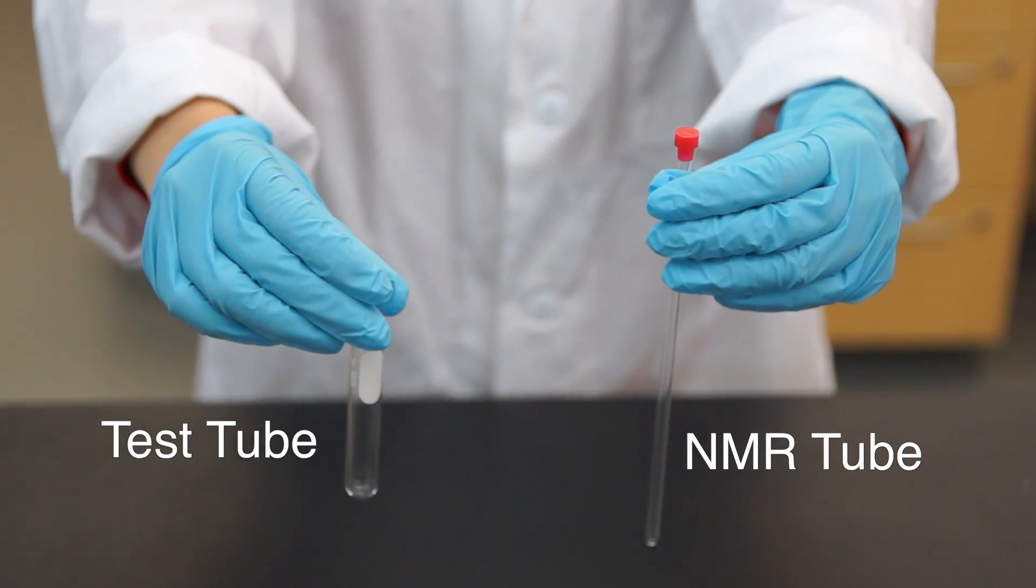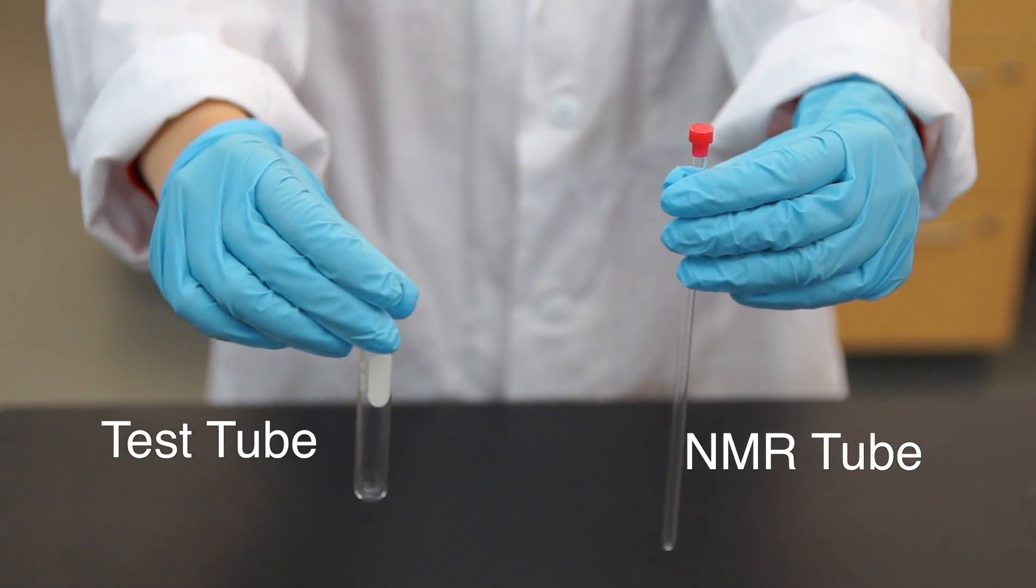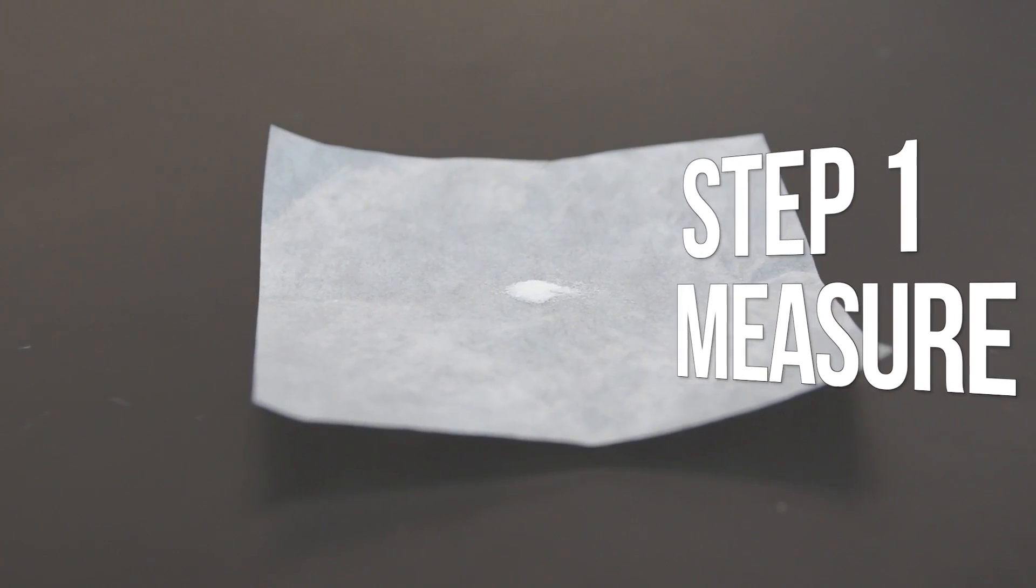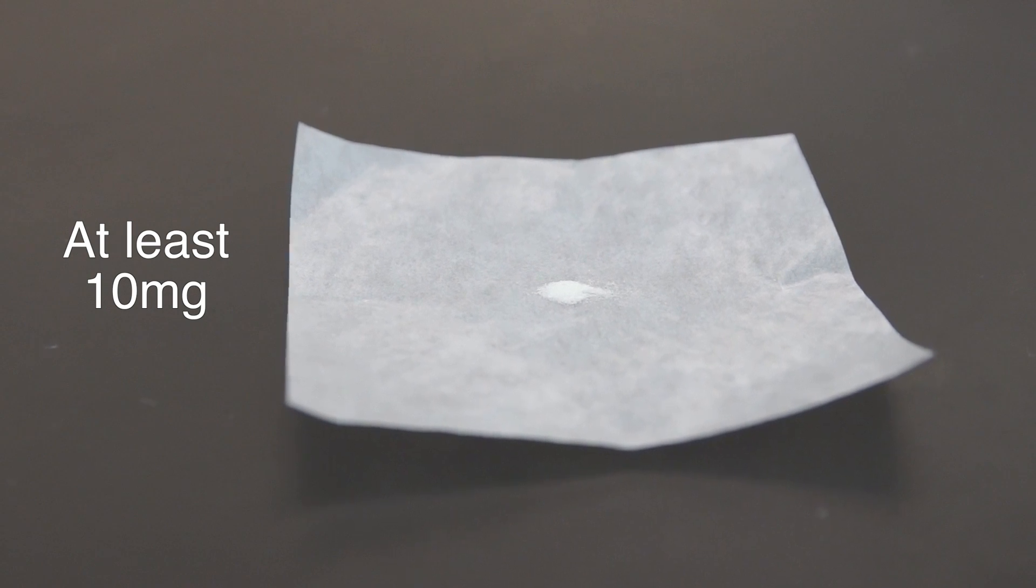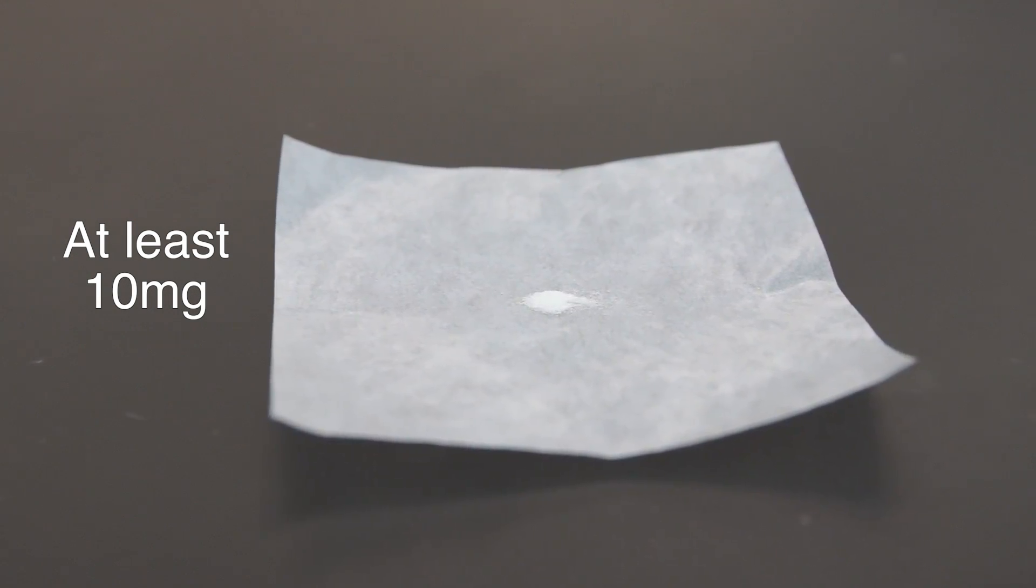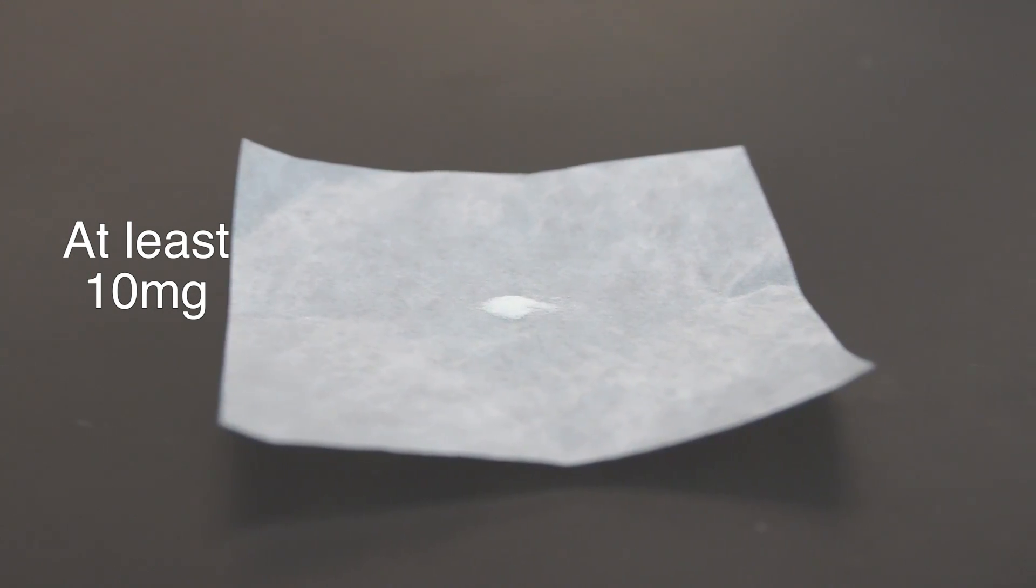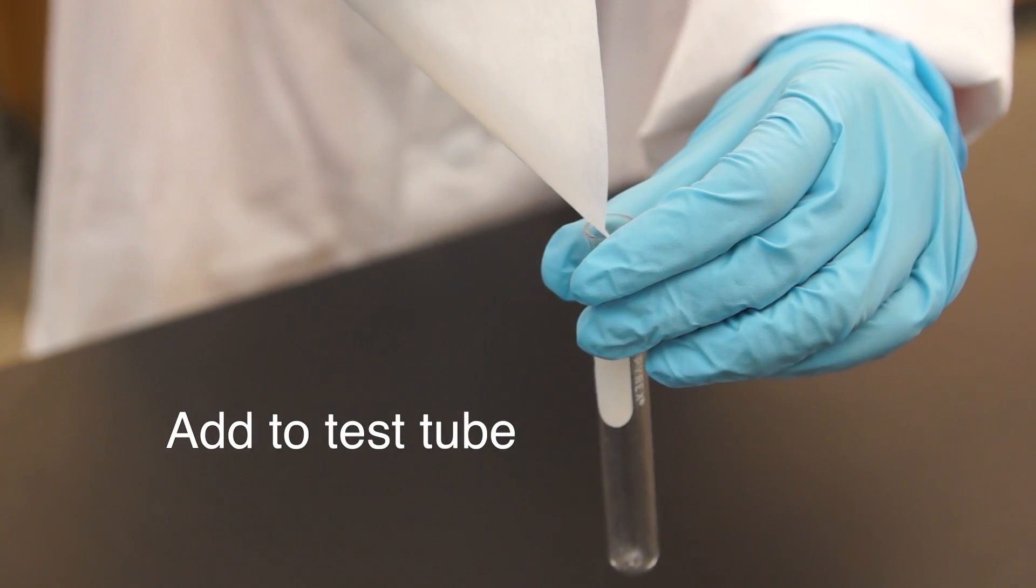Grab your test tube and NMR tube. First, measure out your sample. For proton NMR, you'll want at least 10 mg of sample. For carbon NMR, you might need up to 50 mg of sample. Now, add your sample to a test tube.